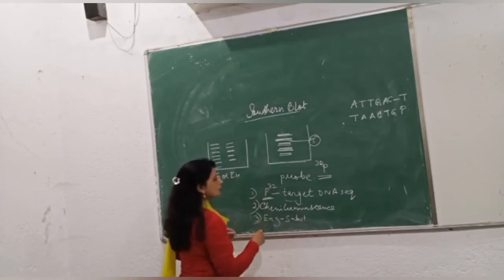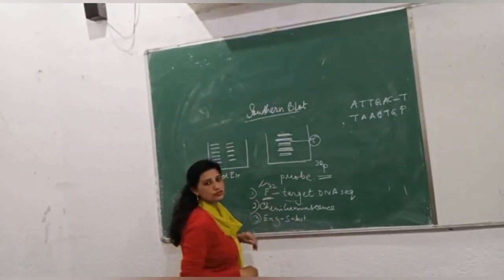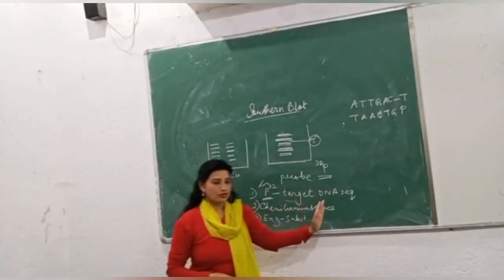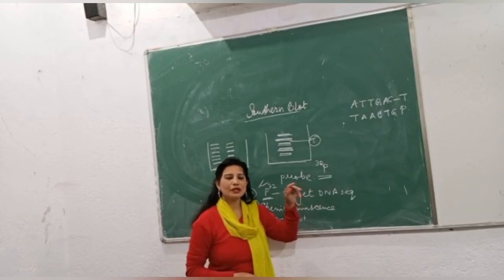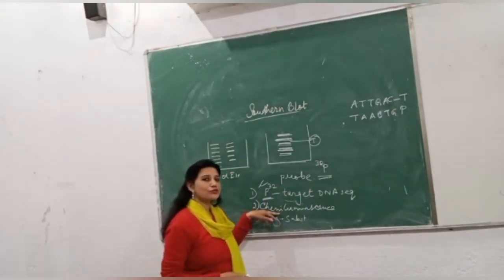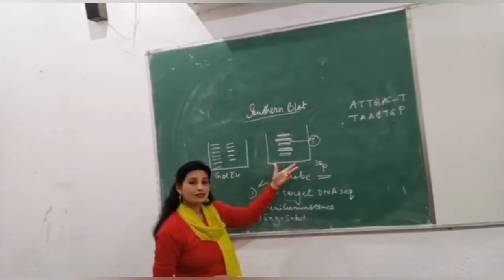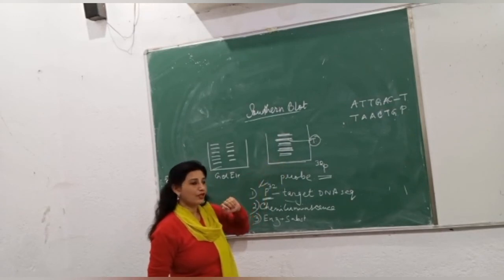But overall, the method that is applied in our labs is P32 only, the radioactive isotope, and this process is known as autoradiography, and this method is generally applied on a large scale. Otherwise, chemiluminescence is also used. There are some chemicals which will be emitting light. Henceforth, if light is there, then obviously you can understand that is the target DNA sequence.